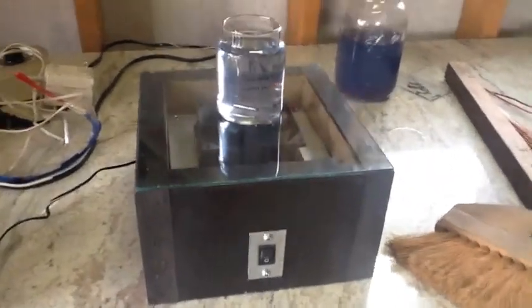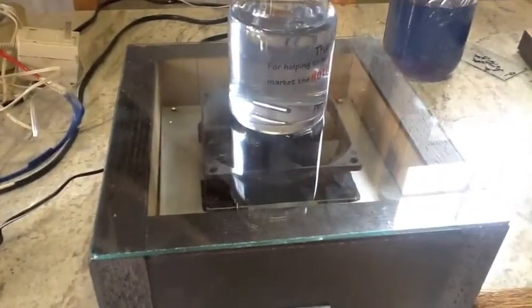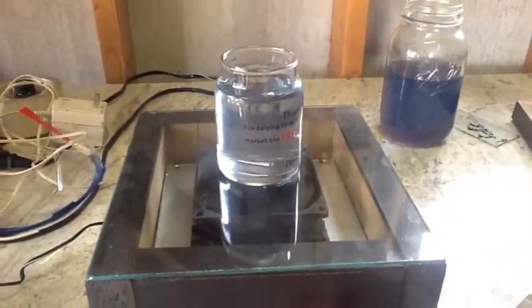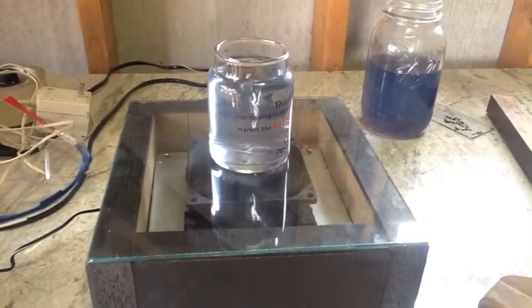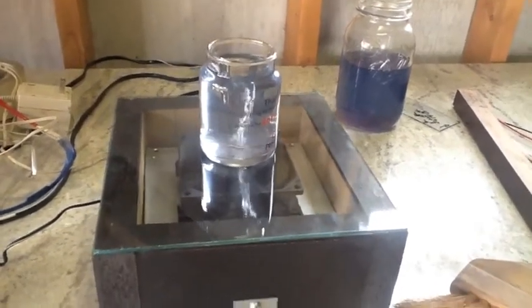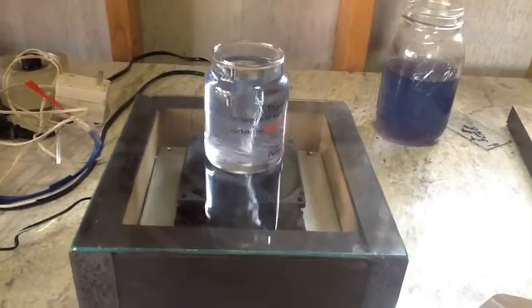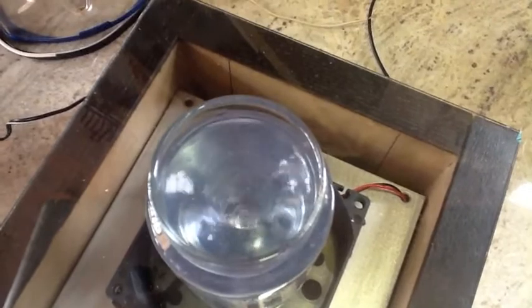Alright, the moment of truth. I've got my small vessel over here — there's my stir bar. Let's turn this guy on and see what we got. It seems to have a lot of power. Pretty fat vortex there. Looking pretty good.